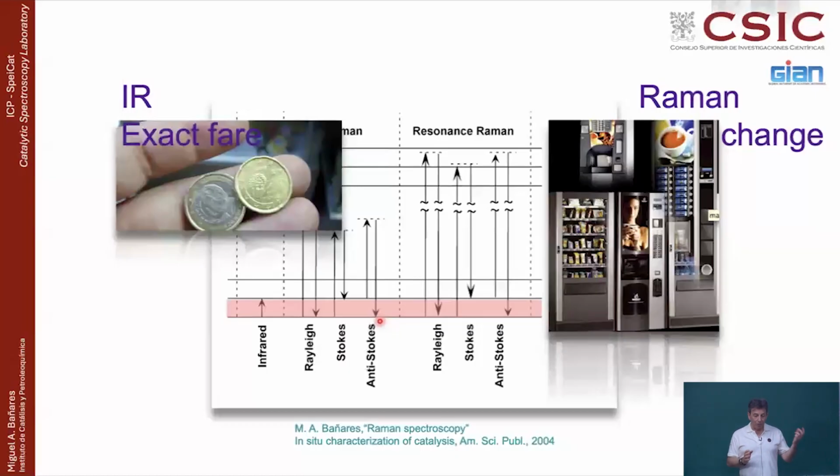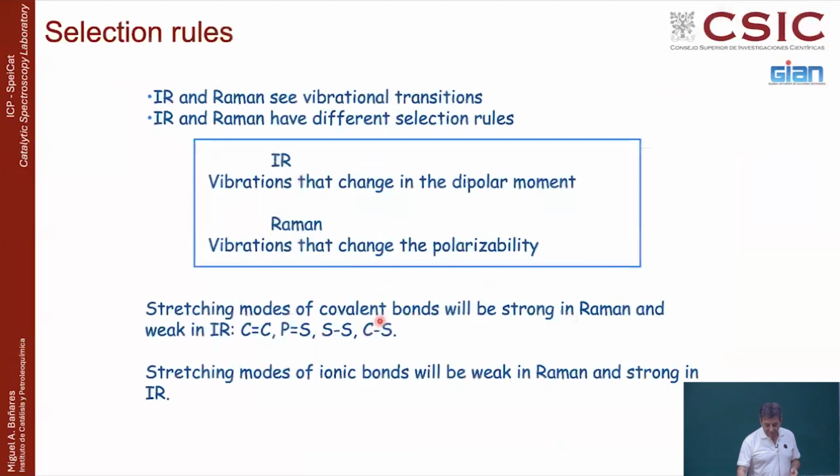And talking about one photon or two photon phenomena completely changes the nature of what you are observing. Because indeed, you are going from A to B, but you go either directly or you go all the way up and back. So you go from A to B, yes, but the way you use is different. And when you travel, if I travel from here to here directly, or from here to here going like that, I will see different things. Same thing happens for spectroscopy. They will see different things. And what will be the main differences?